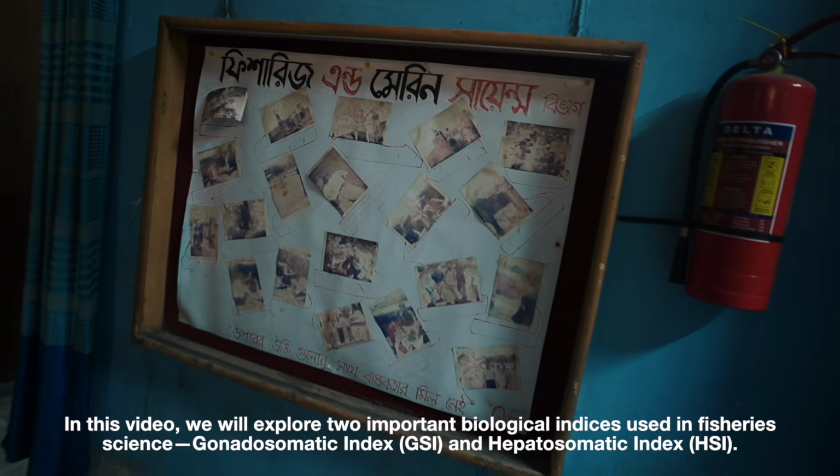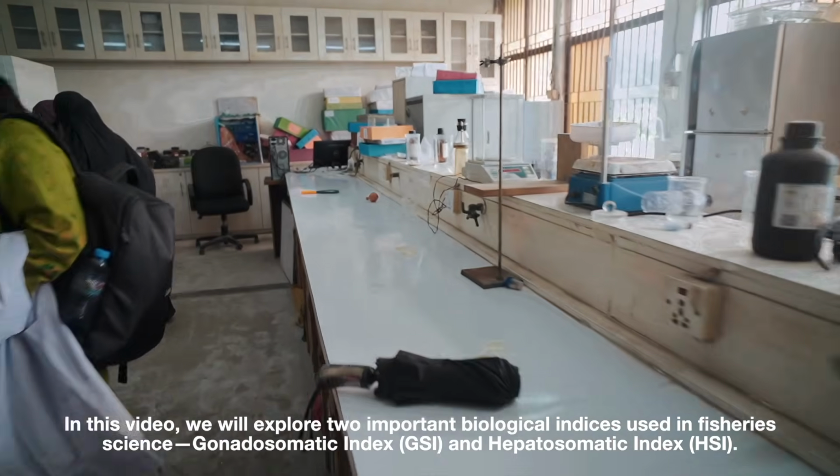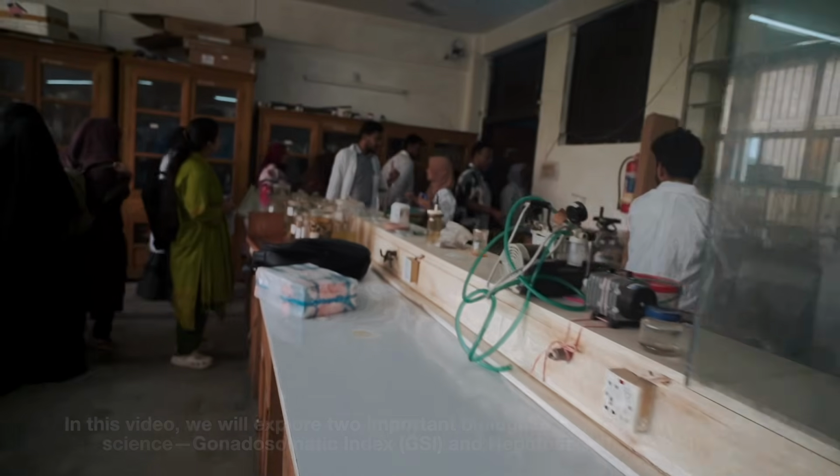In this video, we will explore two important biological indices used in fisheries science, Gonadosomatic Index and Hepatosomatic Index.